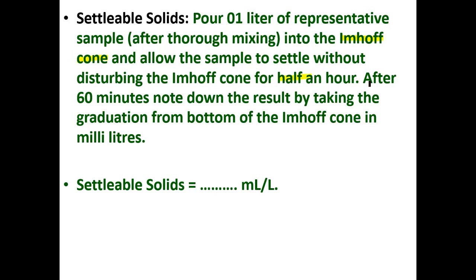It should be 1 hour. After 60 minutes, note down the result by taking the graduations from the bottom of the Imhoff cone. So that Imhoff cone will have graduations which you can measure.